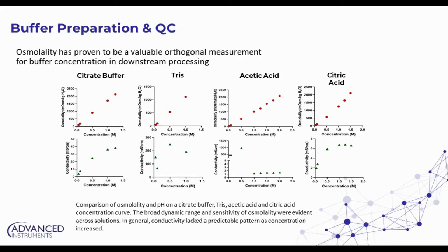And when it comes to buffer preparation and QC, and just speaking to these buffers that are used throughout downstream processing, it's critical, as Dr. Jungbauer mentioned. So we did want to show some data from a study that we completed last year. And while simple, it really does show some pretty key information when it comes to dilution curves.